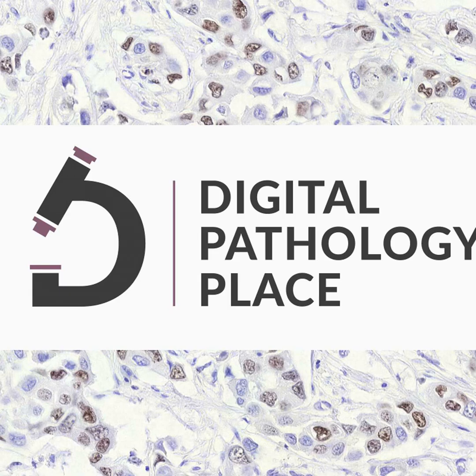So we like to be as tool agnostic as possible. And that's maybe something we can sneak in. So what this field really needs is more common data formats. It starts with the image, but then of course it continues also with the image analysis data, because depending on the tool you have, depending on the in-house custom software you wrote, you end up with a different format, which then means community sharing of tools and having standards is really a problem.